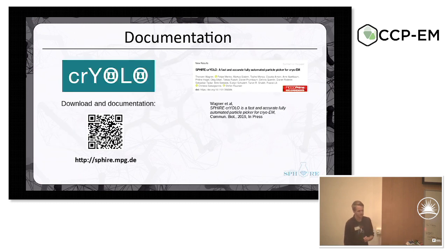Okay, I try to provide a lot of documentation on how to use crYOLO, how to create general models, and how to use the filament mode in a step-by-step manner. It should be very easy. Check out our preprint, and the final paper will be available soon.